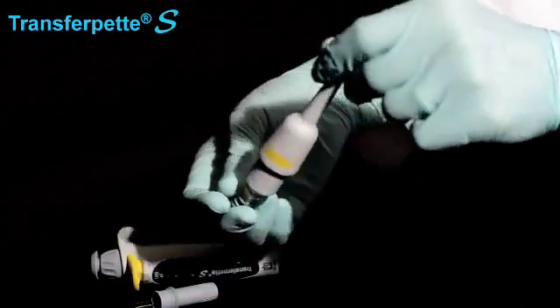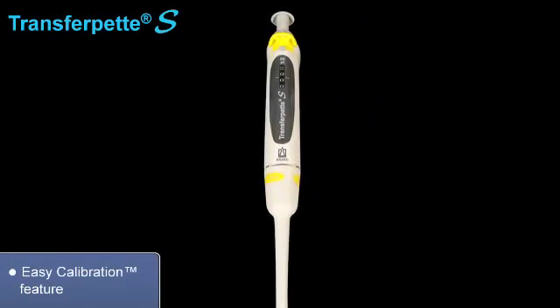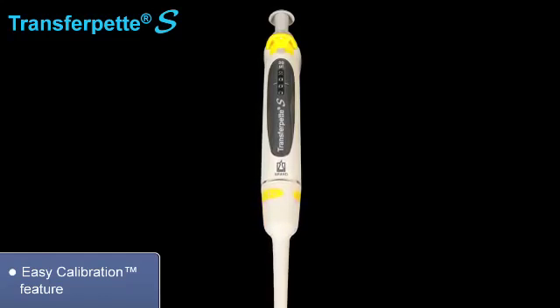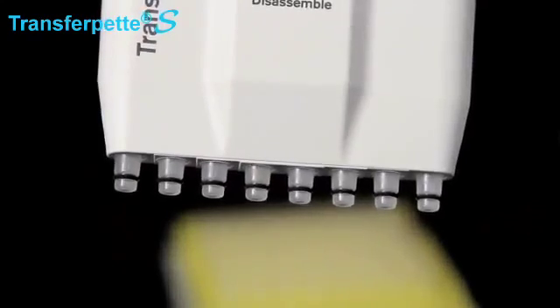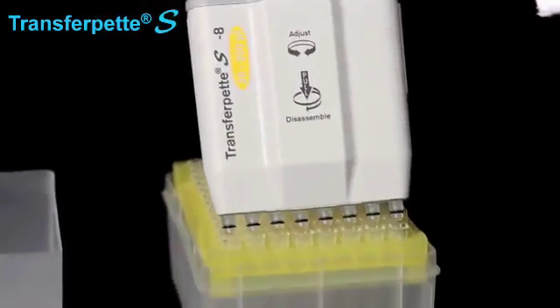The easy calibration feature makes it simple for the end user to perform calibrations and make simple adjustments. Multi-channel models offer the same great features as the single channel models, plus v-rings for broad tip compatibility and low tip mounting and rejection forces.